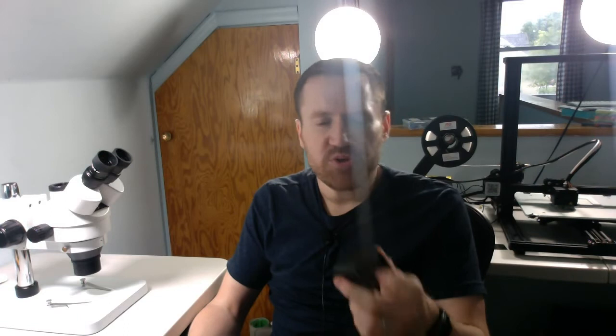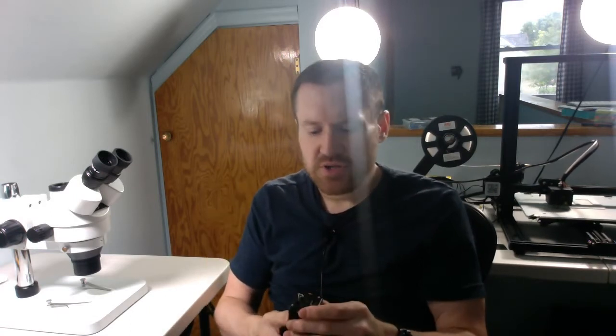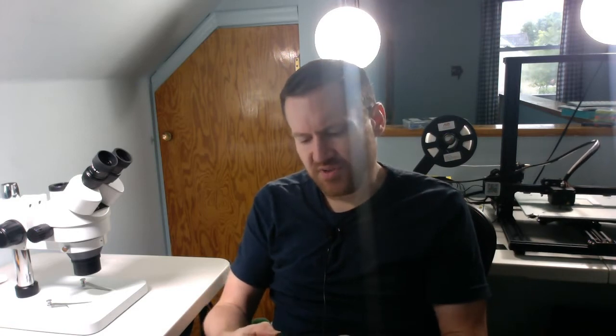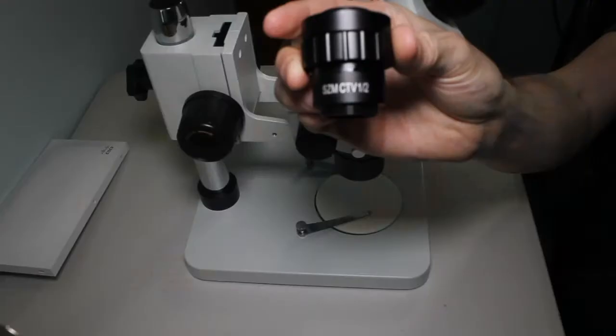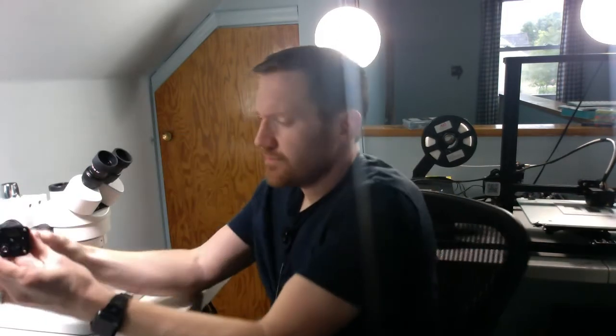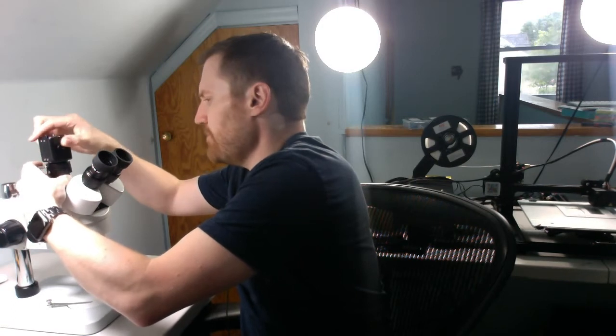Finally, we have our actual CCTV video component. This does 1080p and outputs to HDMI. When you're working on various projects, you get the same view through your eyes into the video screen, and you can stream to YouTube, record it, or display it to a classroom — quite handy. There is a lens for this, just labeled SZM CTV one half. These thread together, and the assembled component screws right down into that third optical support at the top.